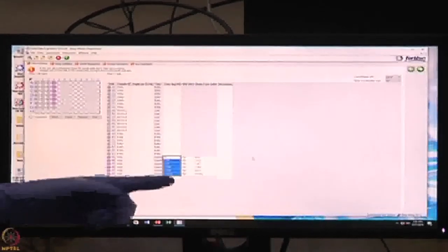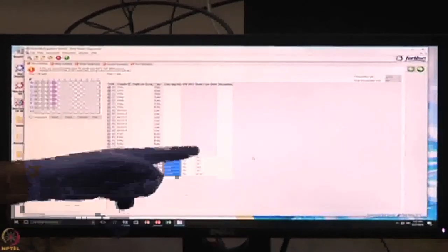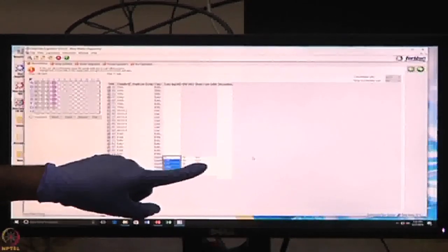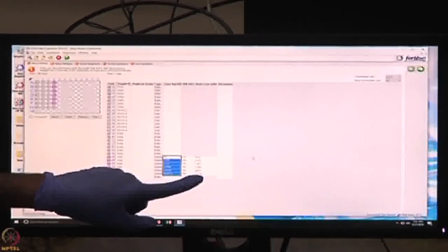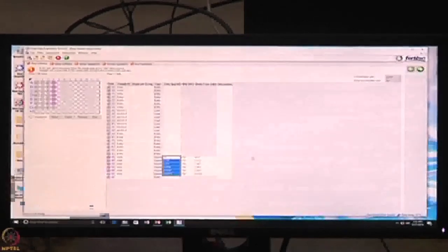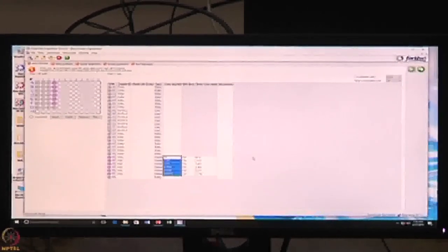Then automatically, when you choose this, you have a threefold dilution. So the KD range covers from 66.67 nanomolar, going through six concentrations with threefold dilution, all the way down to 0.2 nanomolar, which is roughly equivalent to 200 picomolar. So these are the things you fed in the plate definition.